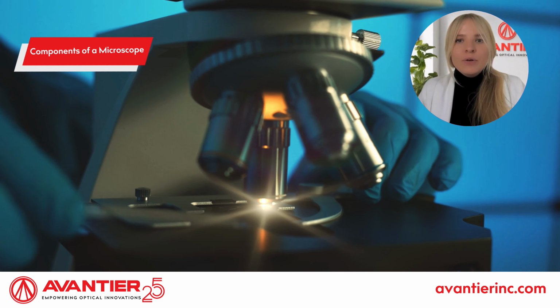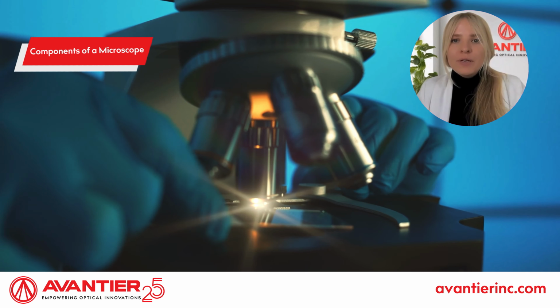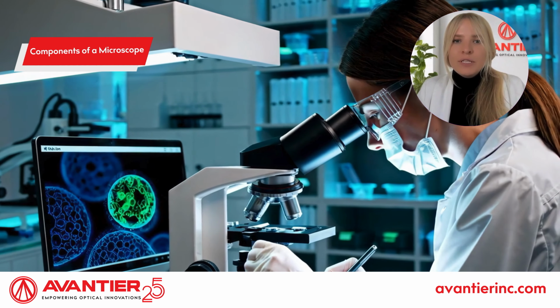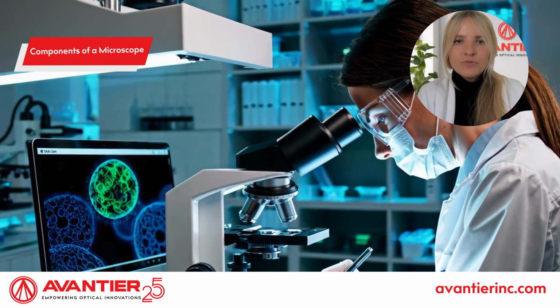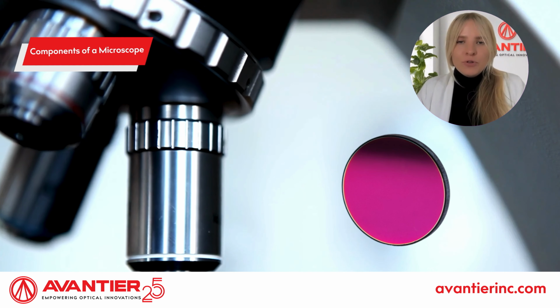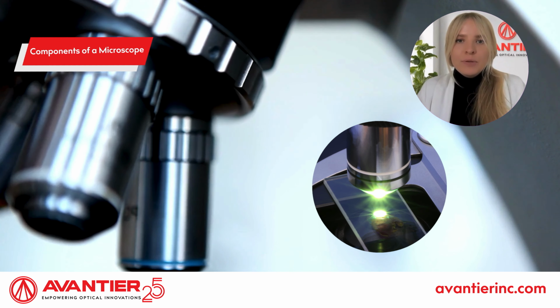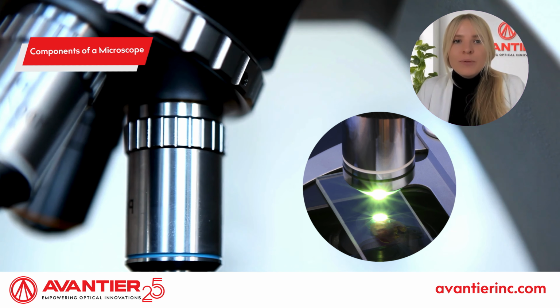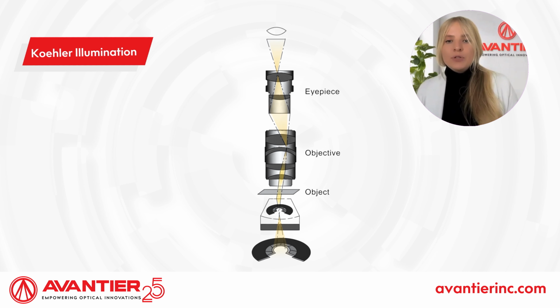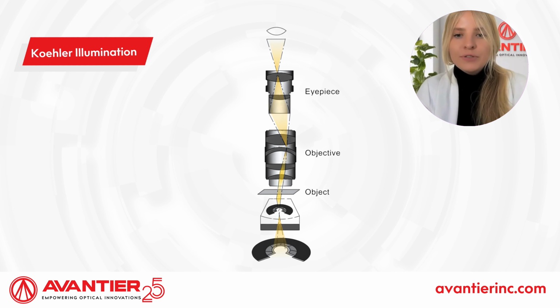Let's take a step back and look at microscopes as a whole. Microscopes are optical devices designed to magnify objects, revealing details invisible to the naked eye. They project images to the eye, a camera, or a video device. Modern microscopes are complex devices composed of lenses, filters, polarizers, beam splitters, imaging sensors, and illumination. Proper illumination ensures clear images, and techniques like Kohler illumination optimize lighting by providing uniform brightness while preventing the direct imaging of light sources like filaments.